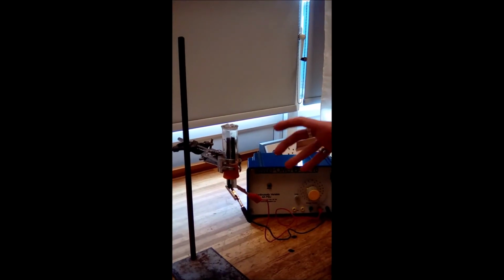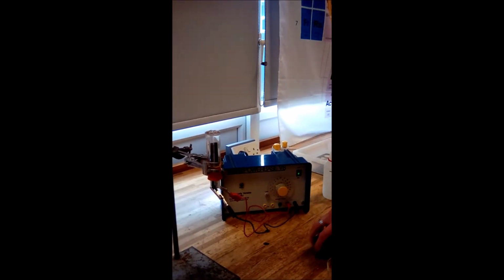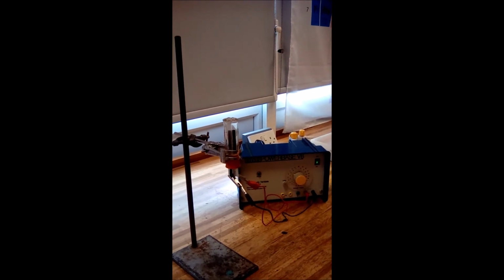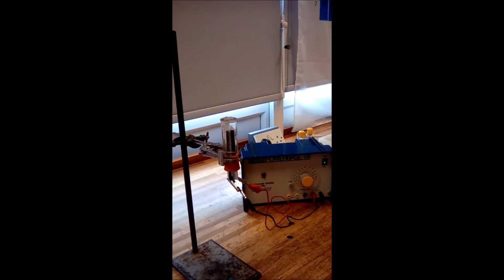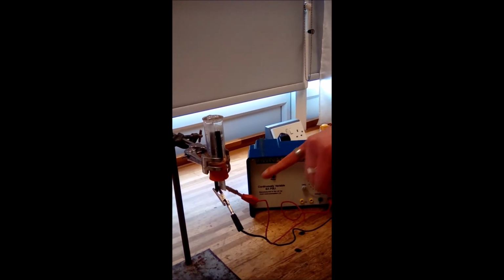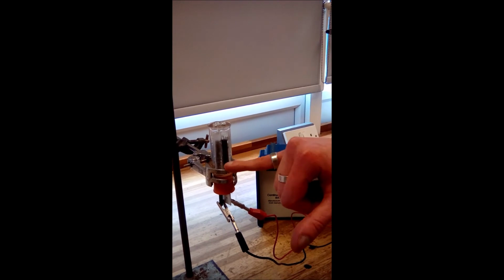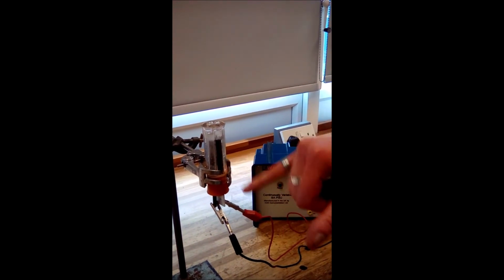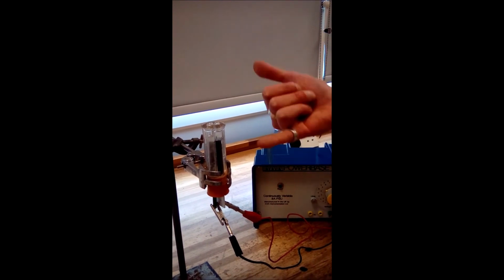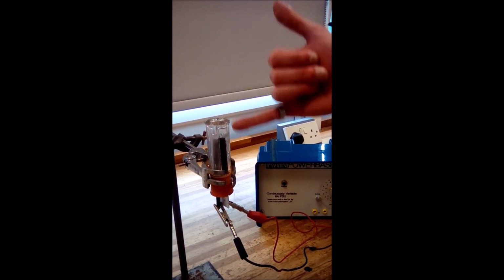What we have here is an electrolysis test to check for chlorine. So what I have in this electrolysis setup here is sodium chloride. Okay, so it's got sodium and chlorine in it. And so what we're doing is using electrolysis. We've got our positive anode and our negative cathode. And because chlorine is the negative ion in the sodium chloride, it forms at the positive anode.